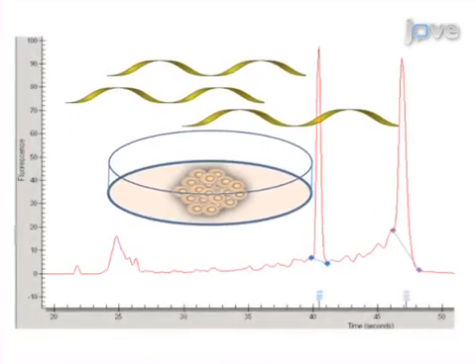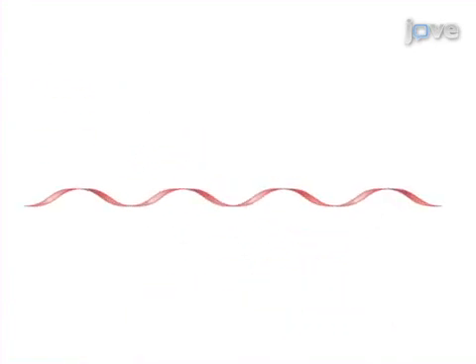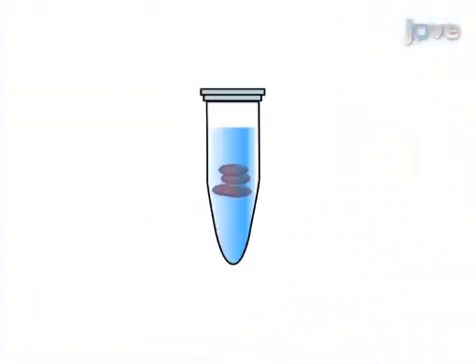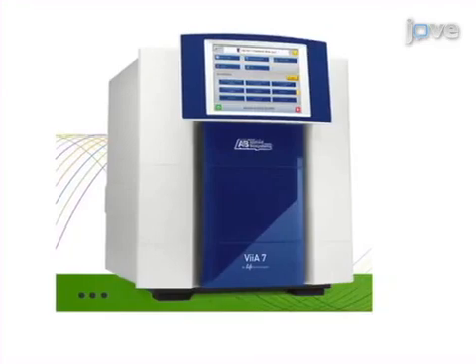checking the RNA quality. The second step is to construct DNA libraries from those RNA samples, streamline the cluster generation using the CBOT instrument, and carry out the DNA sequencing task on the HiSeq 1000. Next, data analysis is performed to ultimately identify and display differentially expressed gene transcripts. The final step is to validate RNA-seq results by RT-PCR.